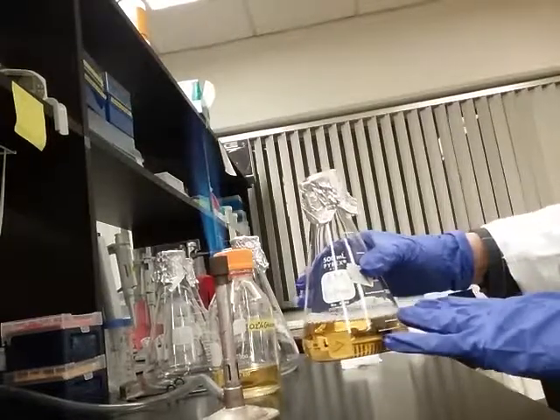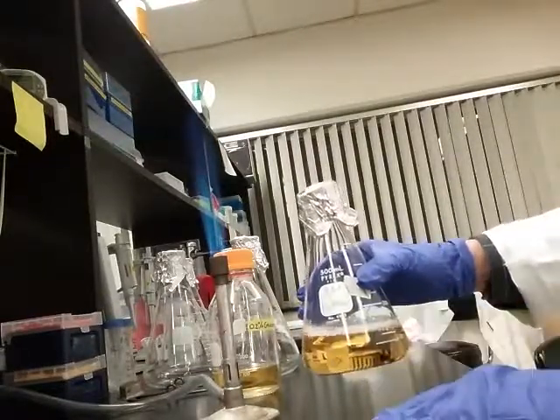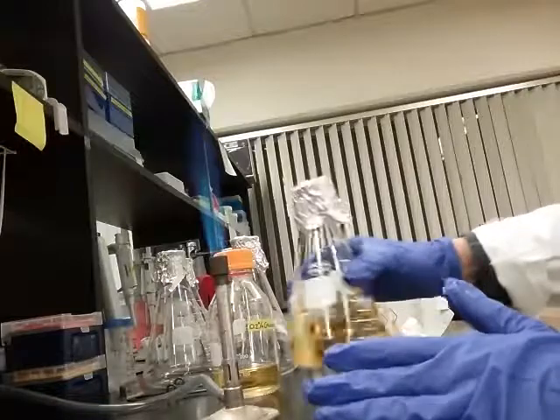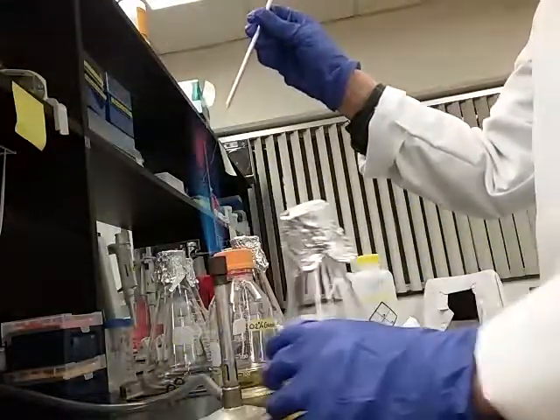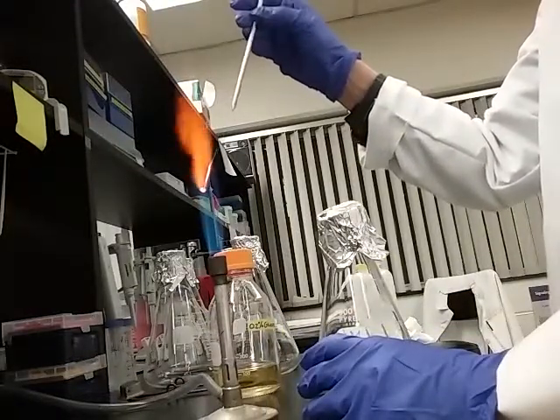This 200ml starter culture, once inoculated from the plate tonight and growing thick with bacteria, will be good to inoculate about two liters — a 10 times volume — of culture tomorrow morning for the day culture. So what we're going to do right now is get some bacteria into the starter culture.